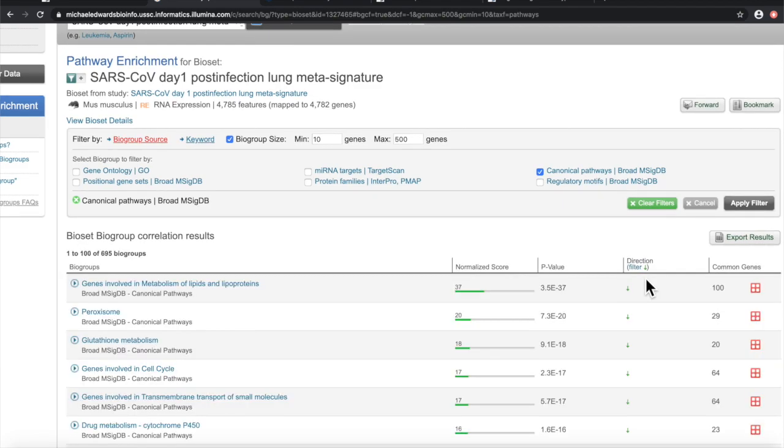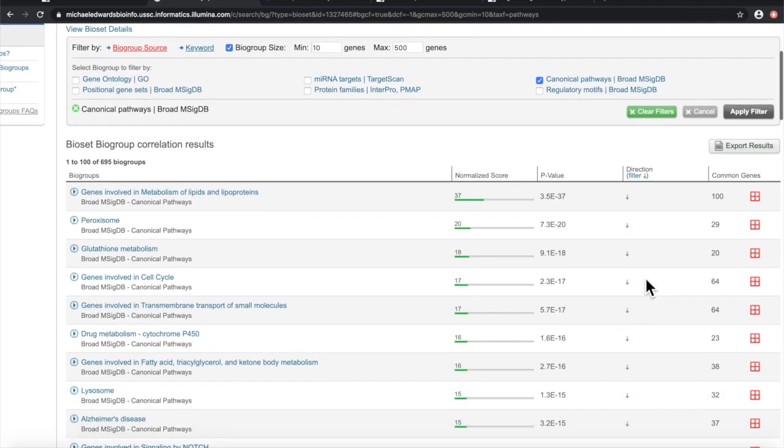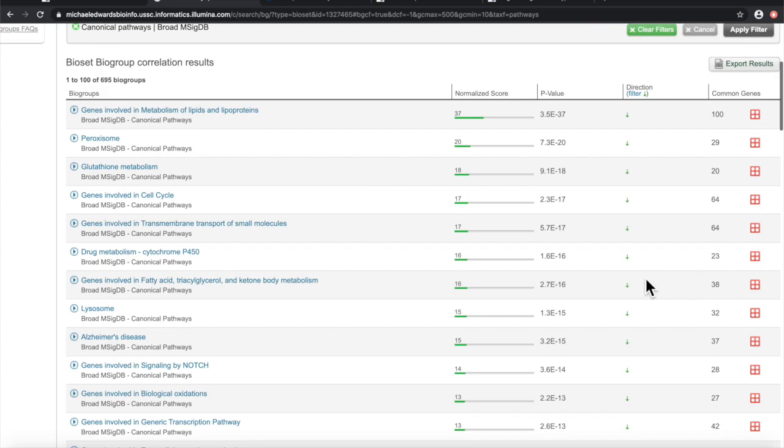I think looking at the genes that go down in an infection can many times be way more informative than seeing what goes up. As we've seen in this example, most of the increased expression of genes with this type of stressor are related to the body trying to alert the immune system that it has a problem with an invader. And as we've seen, this can be more like a scream. But the genes that go down often relate to the systems that the virus needs to suppress or manipulate in order to successfully invade its target cells.